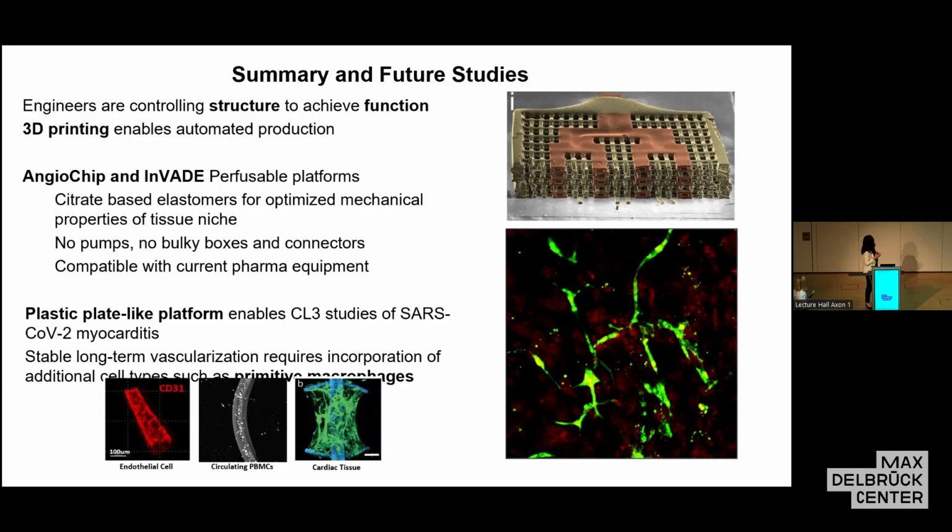Yeah, well, definitely that would be really important if you're working with something like gut on a chip or skin on a chip, right? So I would say in most of the cardiac applications, we only applied one virus. We didn't go into complexity. The only one virus that we applied is SARS-CoV-2, or we would apply common cold coronaviruses like NL63 or 229E. So we didn't really apply anything more complex where you would have several of them. And I think that's definitely important for gut on a chip. Okay, a couple of questions in the audience.